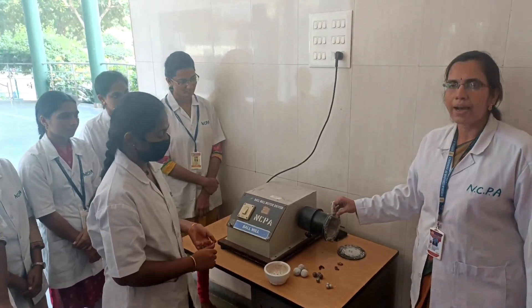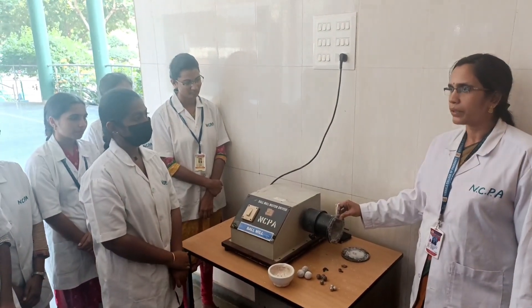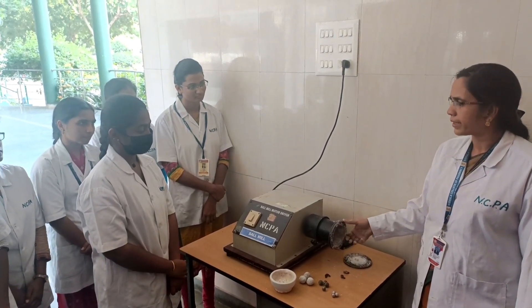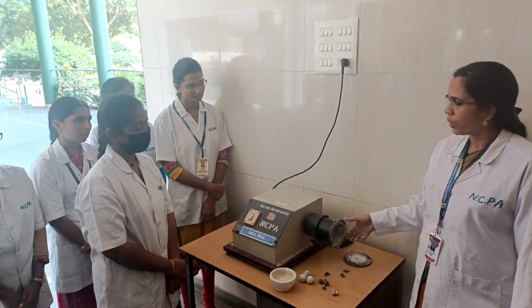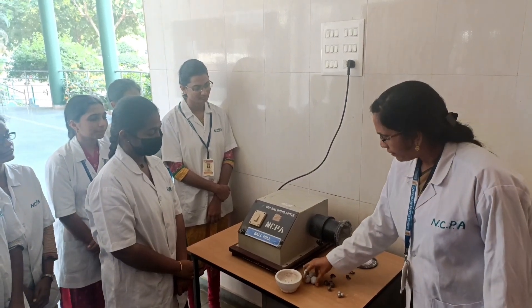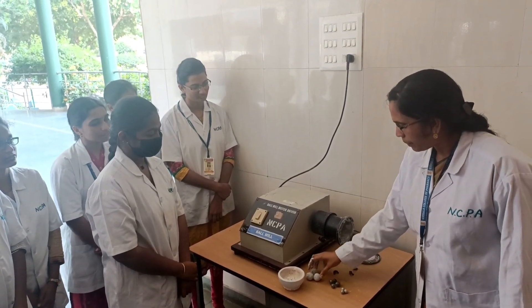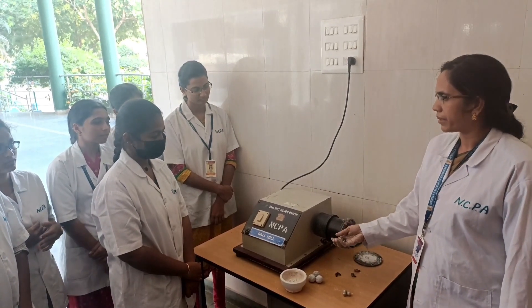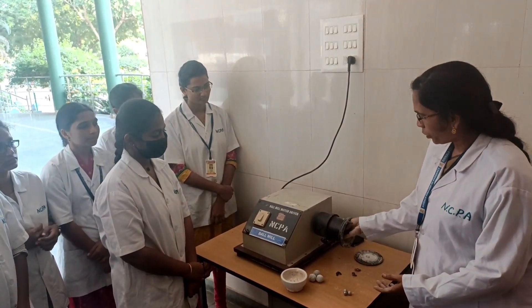Here, this is the hollow cylinder which can run on its own axis. Different types of balls, pebbles, and stainless steel bars — made up of stainless steel and rubber with a lid — these are going to be put into it.